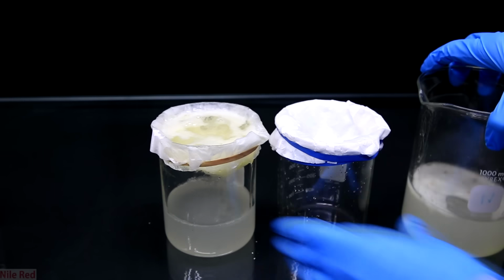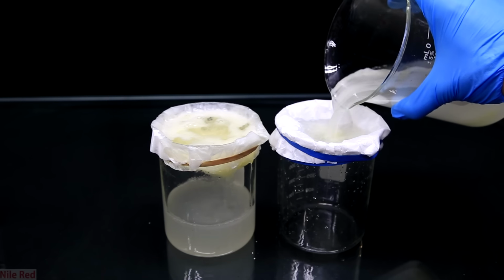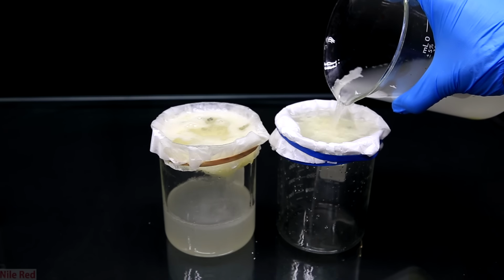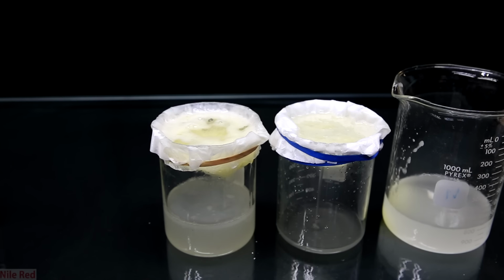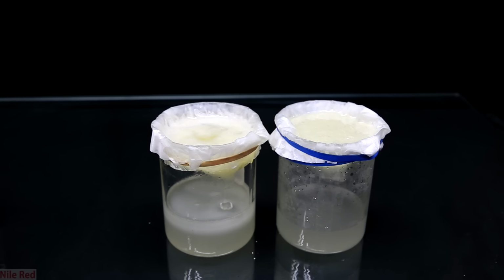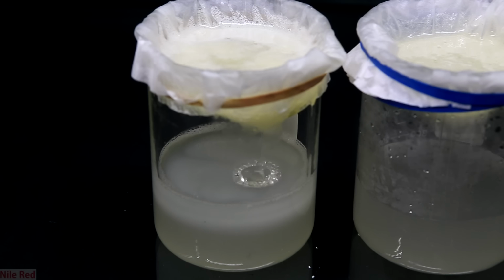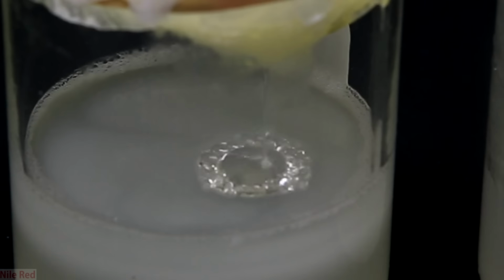We still need to filter through the rest of the solution, but to do this through the polymer would take a while, so I set up a separate filter. The coffee filters here were also doubled, and we filter it just like before. It took a little while, and everything slowly filtered through. As the water filtered through and hit the surface, it made a weird effect. I'm not really sure what the exact reason is for this.